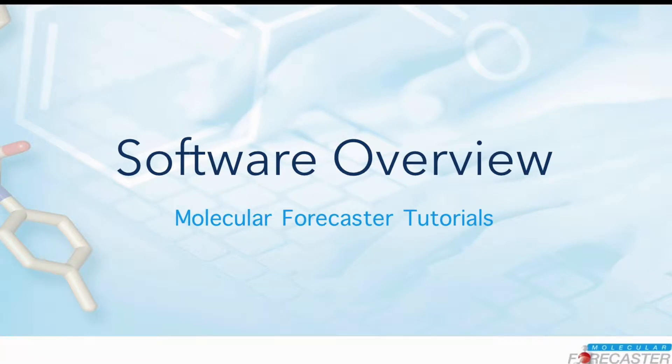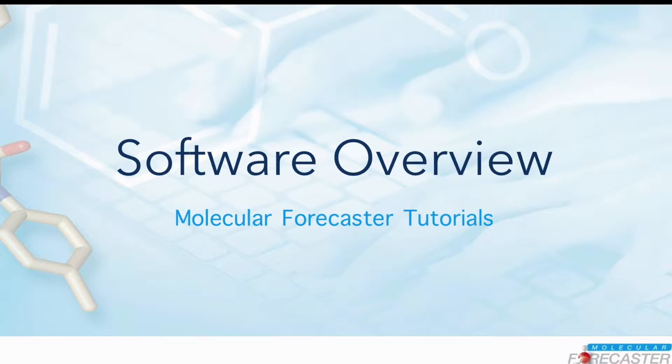Welcome to Molecular Forecaster Tutorial 1 – An Overview. The Forecaster suite comprises a variety of tools for medicinal and synthetic chemistry. In this tutorial, we will cover the very basics of the software contents, layout and action buttons.